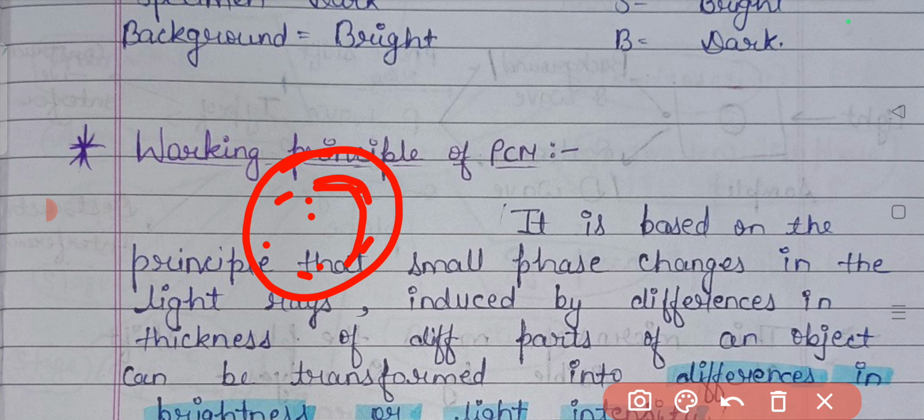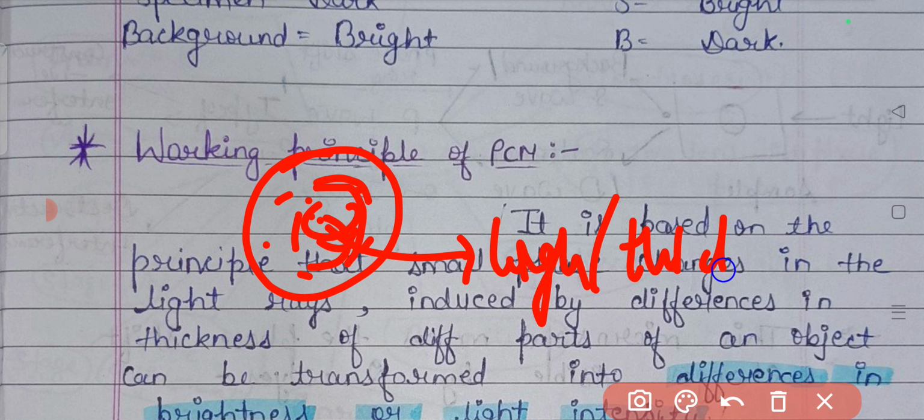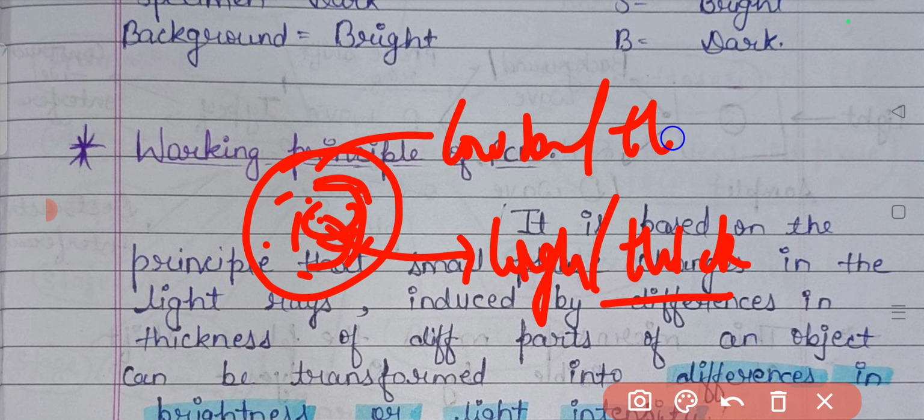At some point, it has high density, or we can say it has thickness present here. And at the boundaries, it has low density and less thickness.